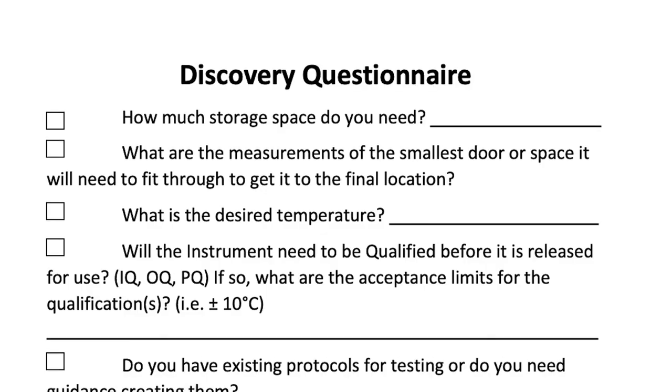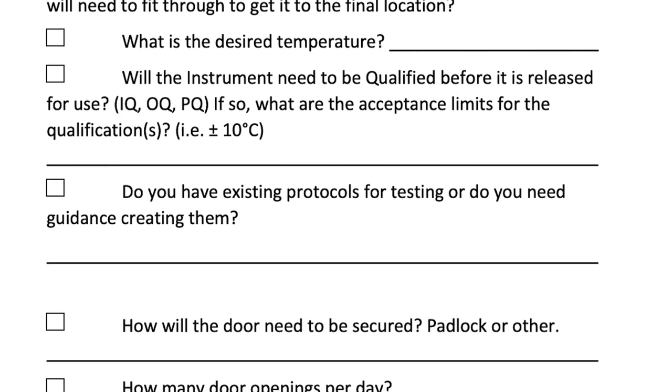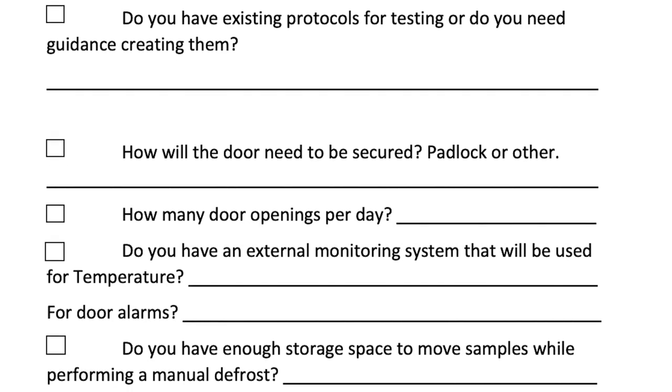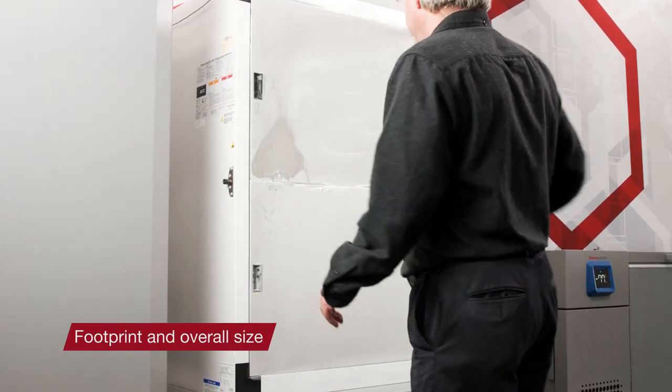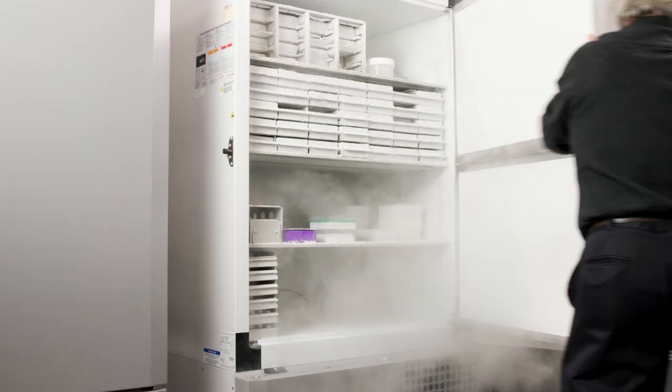During this process, you'll answer a series of instrument discovery questions. This will help you find the type of freezer that best meets your storage needs. To get started, look at the laboratory or warehouse space that you have available. Is there enough room for an upright or chest freezer?